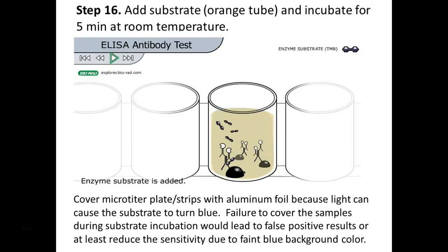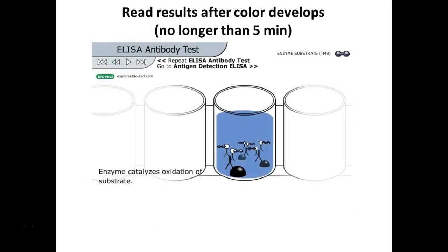It takes seconds once you put it in, so we'll be able to know our answer right away. Normally you would cover it up with foil while waiting to use it in the plate reader, to keep it from overreacting. So you wouldn't want to wait more than 5 minutes before you would read it on the spectrophotometer.